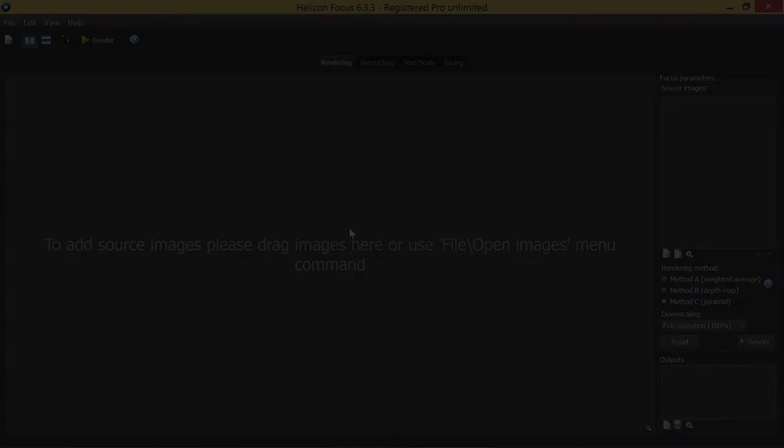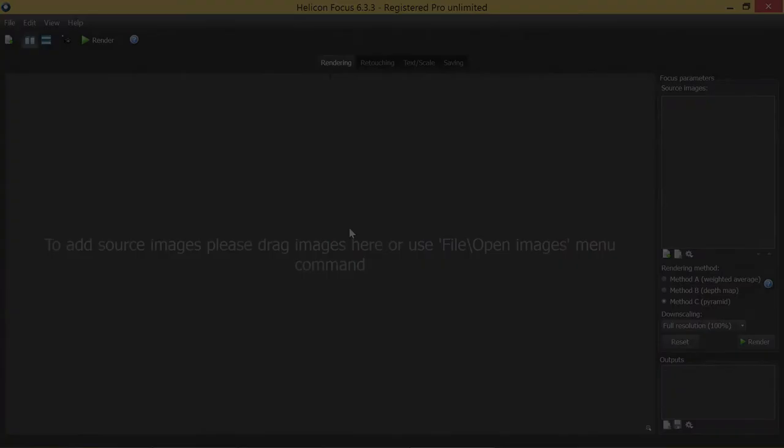Let's start by opening the batch process dialog. Go to main menu, file, batch process.